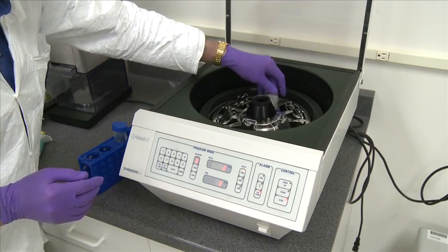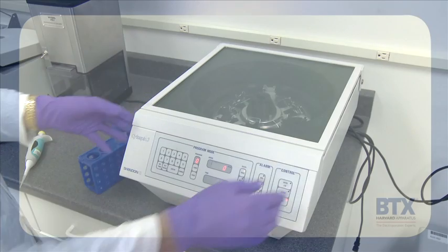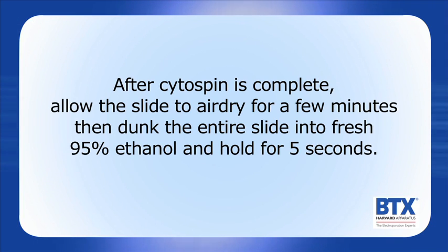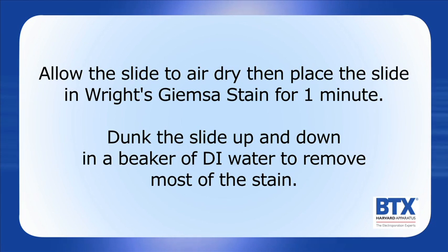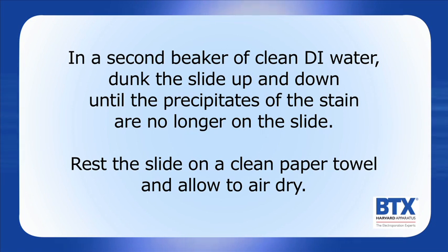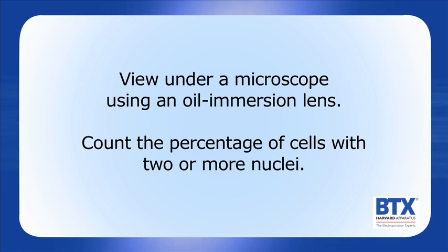Repeat for the other side using 100 µL. Place cytospin slides into the cytospin and set to 350 RPM for 2 minutes. After cytospin is complete, allow the slide to air dry for a few minutes, then dunk the entire slide into fresh 95% ethanol and hold for about 5 seconds. Allow the slide to air dry, then place the slide in Giemsa stain for 1 minute. Dunk the slide up and down in a beaker of DI water to remove most of the stain. In a second beaker of clean DI water, dunk the slide up and down until the precipitates of the stain are no longer on the slide. Allow to air dry, then view under a microscope using an oil-immersion lens. Count the percentage of cells with two or more nuclei.